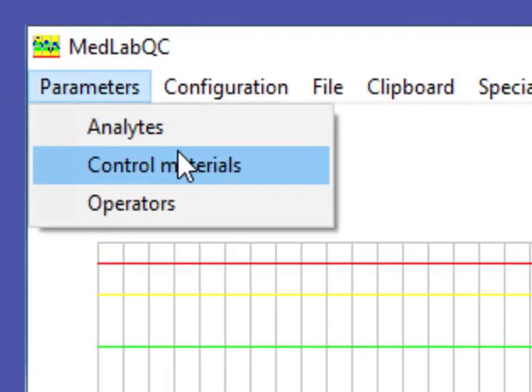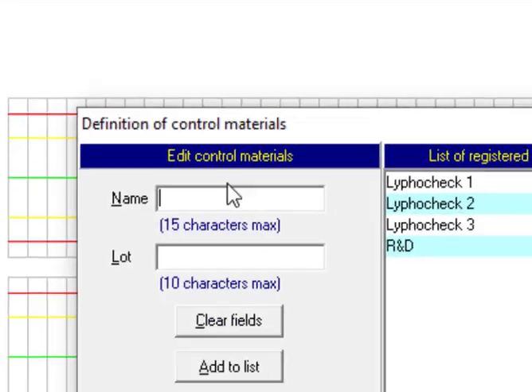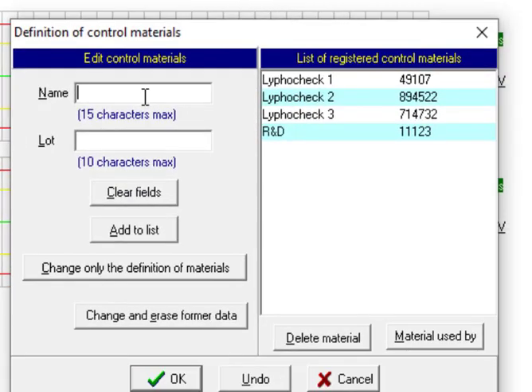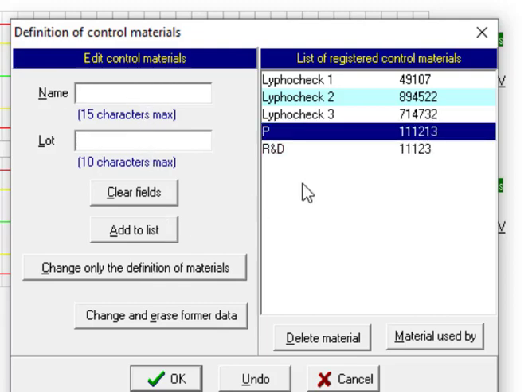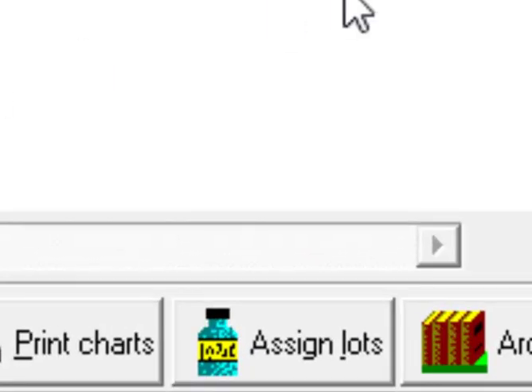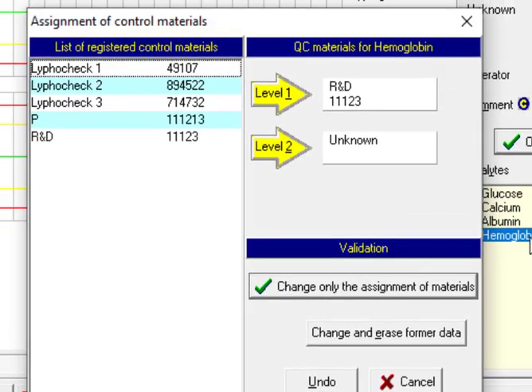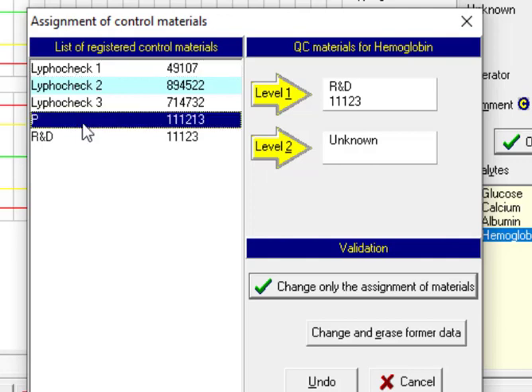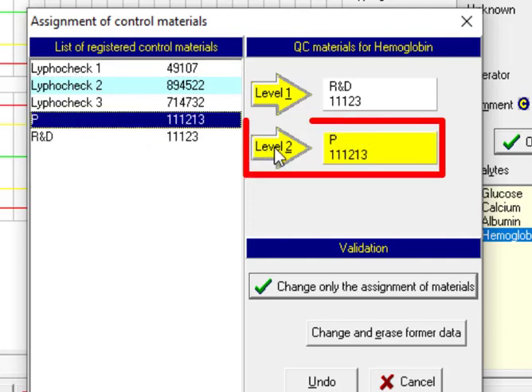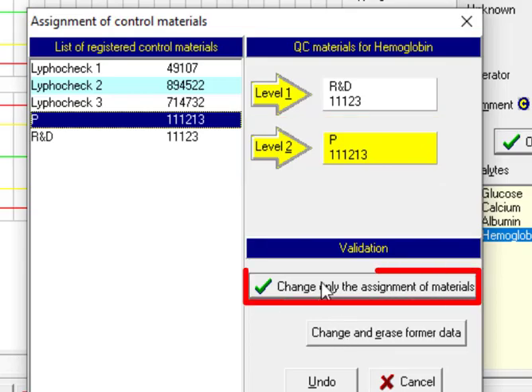And next we define a new one, P for pathologic. The lot number for example is 11 12 13. We press add to list, it's shown here. Press OK and now we assign it for this analyte for the pathologic level. Press change only the assignment.